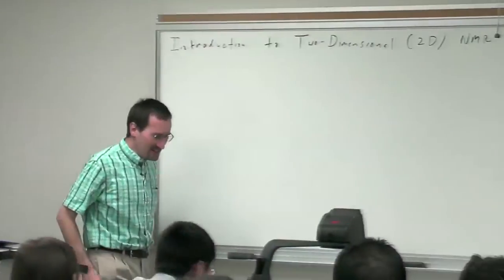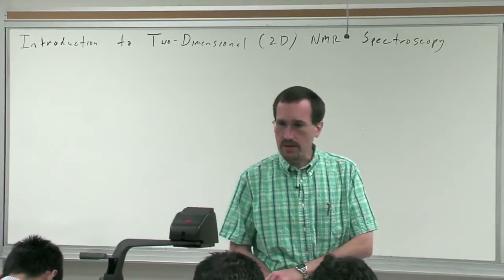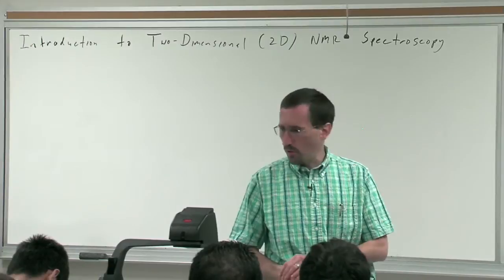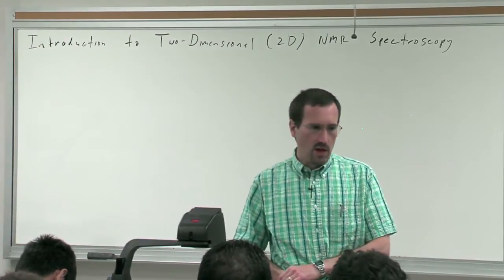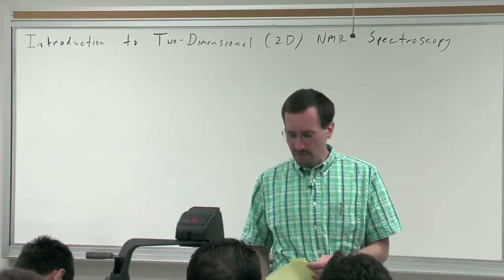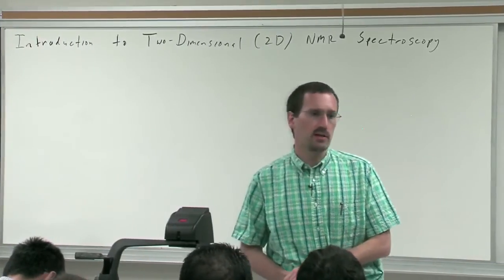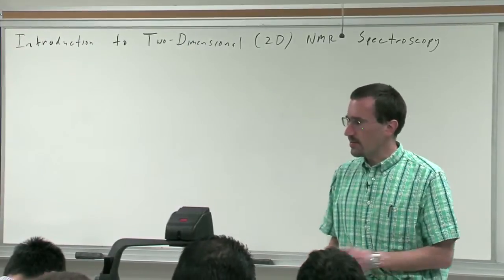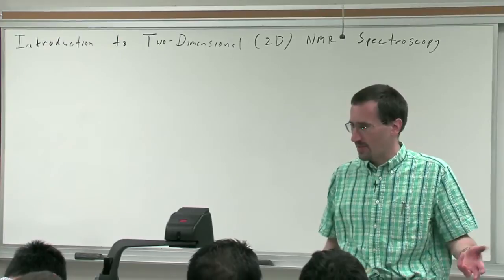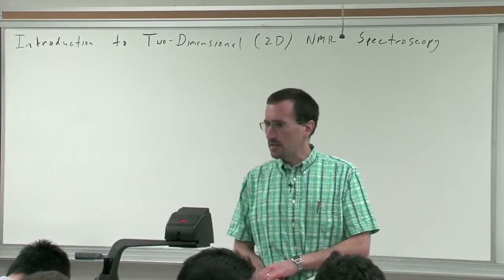I want to move on and start talking about 2D NMR spectroscopy. And what we're going to do, we'll be using this as a tool, very, very useful for structure solving. There's a whole alphabet soup of different techniques, but rather than just unleashing a torrent, people do research in this area just like they do research in organic chemistry. And so the big thing is to invent a new technique to solve specialized problems.